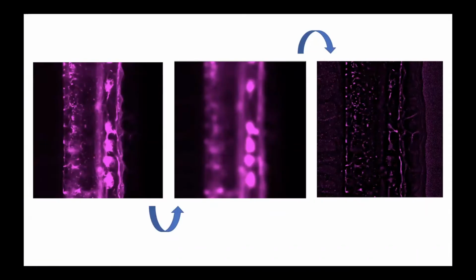Here I have images from zebrafish embryo spinal cord, and in these images, you can see very high background in the ciliary channel. The ciliary marker, especially acetylated tubulin, which you can see in magenta in these images, also stains neurons. And so analysis in this kind of situation is very challenging. But using the background processing tools from CiliaQ, we can retrieve cilia.